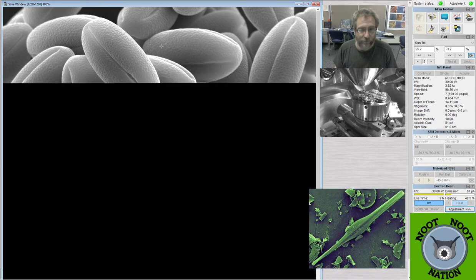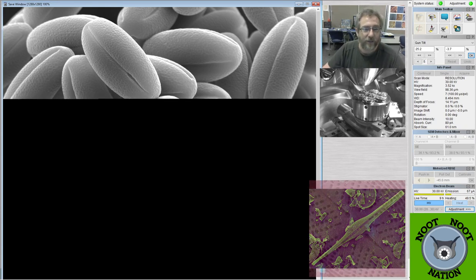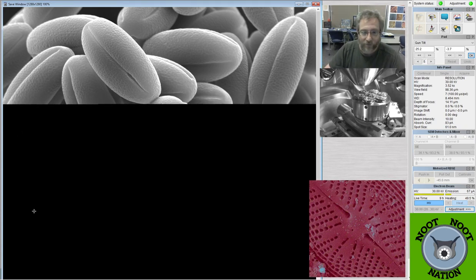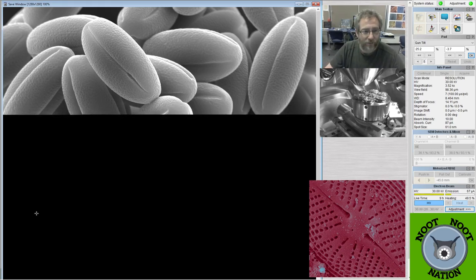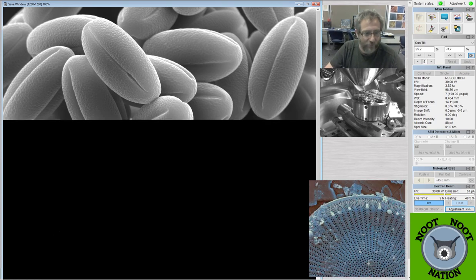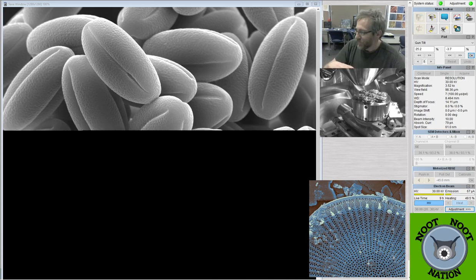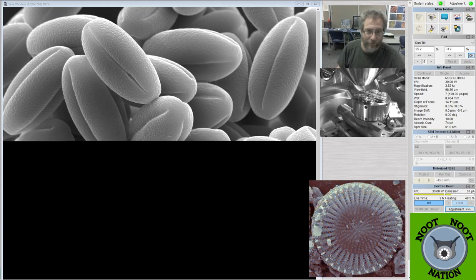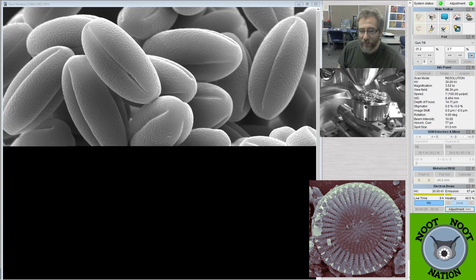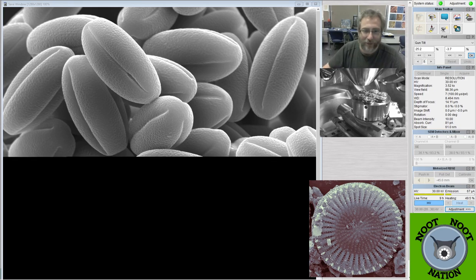And so sometimes it's useful for me to also know the different pollen, because I come across them and I don't feel quite so ignorant when I see it in the microscope, if I can tell what it is. To date, I could easily identify pine pollen and then some grass pollen, but other than that, I'm pretty bad at it. So one nice thing about doing it this way is actually collecting the plant and then putting the flower on the actual stub and then stuffing the flower petal and the actual pollen in the machine means that I can't screw it up too bad. So as long as I can ID the plant, I can ID the pollen now.